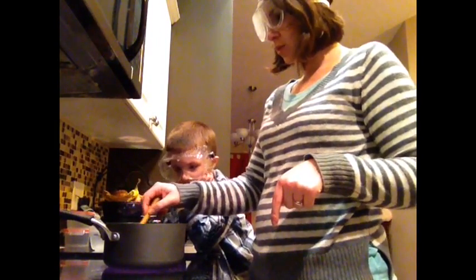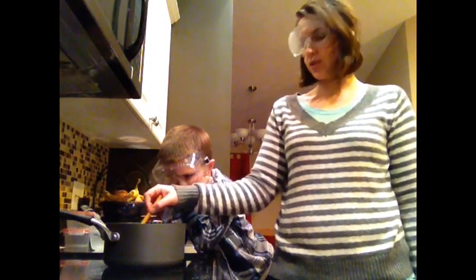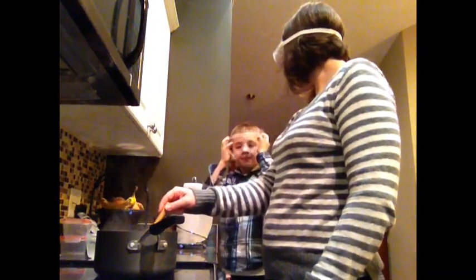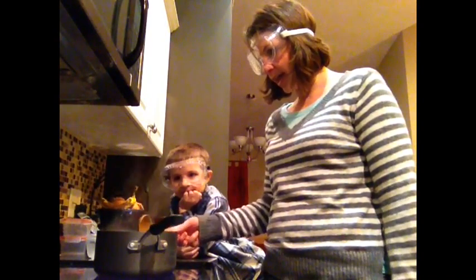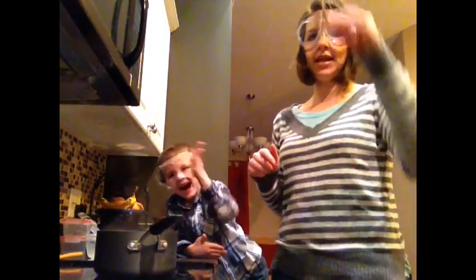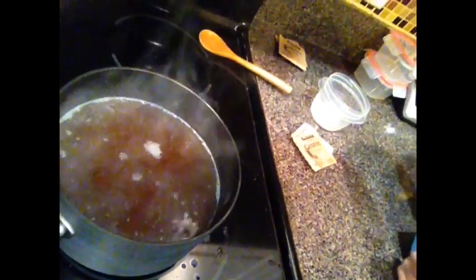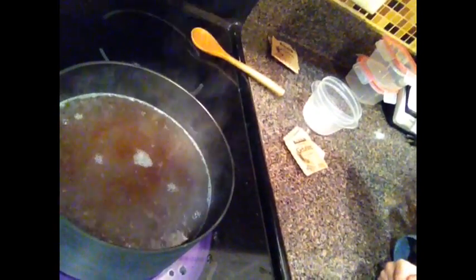Once it comes to a boil, you will remove it from the heat, and then we'll show you what to do to cool your agar off. Our mixture is now boiling, so now what we want to do is remove it from the heat and let it cool for three to five minutes before we pour it into our petri dishes. Here is our boiling liquid, so now we'll let it cool off for three to five minutes before we fill our petri dishes.